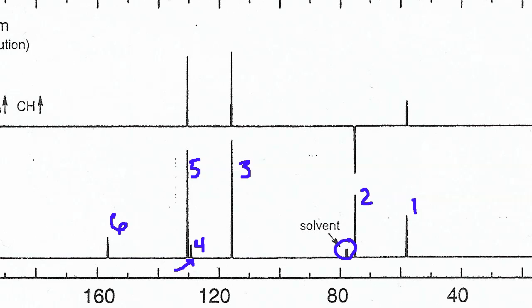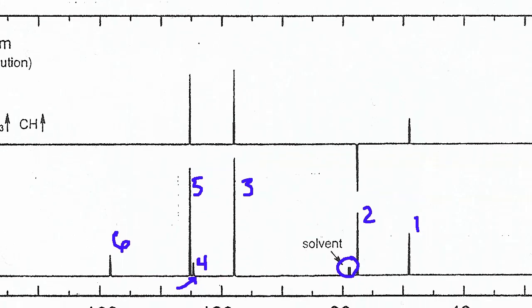We would get some similarity between the carbons. So what we could start to suggest at this point is that perhaps we have an aromatic ring, and that aromatic ring is going to have a substitution pattern that is para, like this, right? With one group up here that we'll call X and another group down here that we'll call Y, because then we have these 2 carbons at the top that are going to be symmetrical, and then these 2 at the bottom that would be symmetrical. So that would give rise to a proper pattern like this.